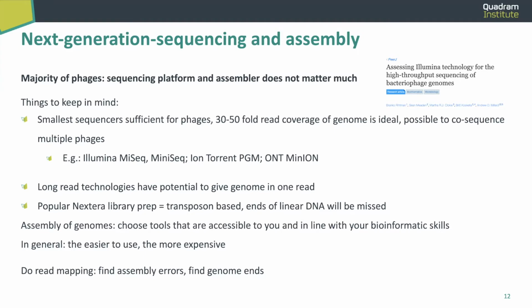There's also long-read technologies, and specifically nanopore has become really popular. They have certain advantages, like you can get the whole genome in one read, for example, but they're usually still more expensive. And nanopore can be computationally expensive to run on a laptop if you want to do your base calling at the same time and such. It's all down to how much money you have to spend and what your setup is at your lab or in the sequencing facility that you contact.